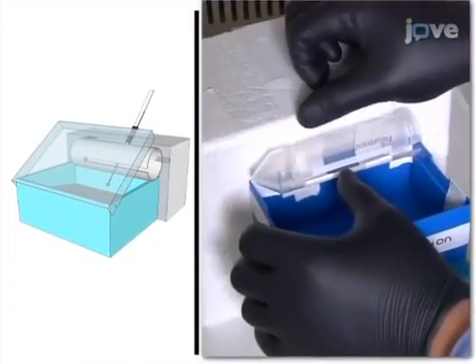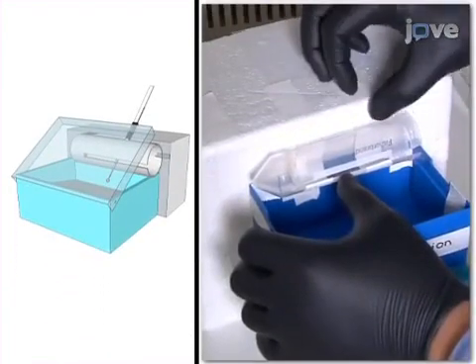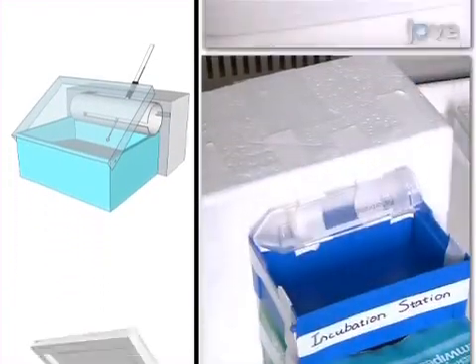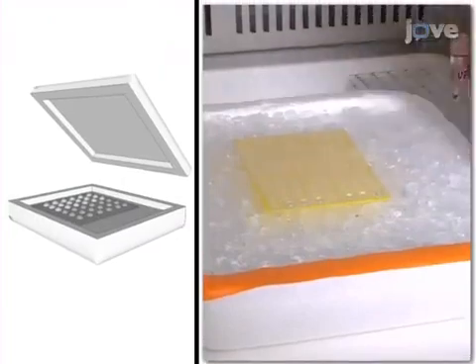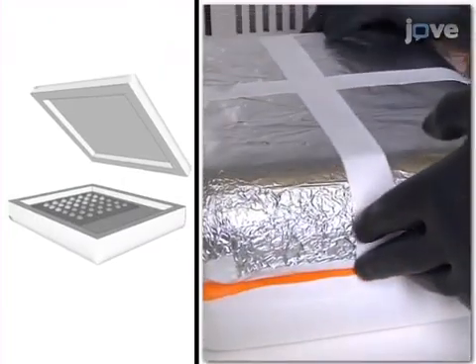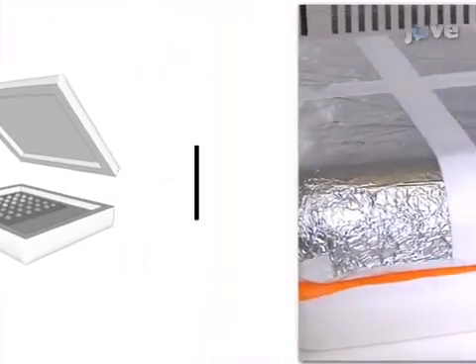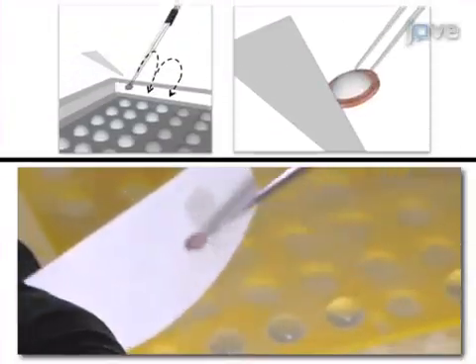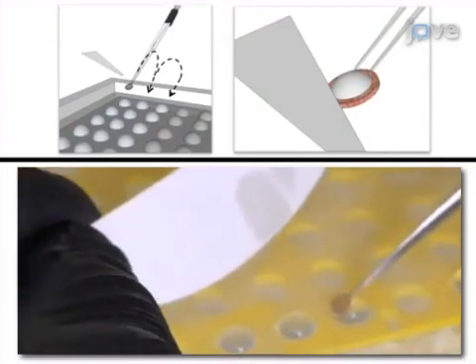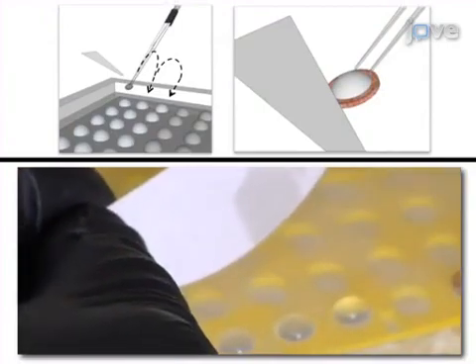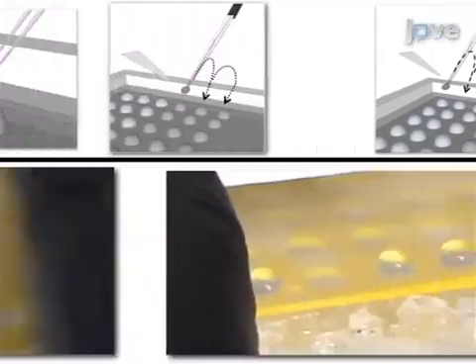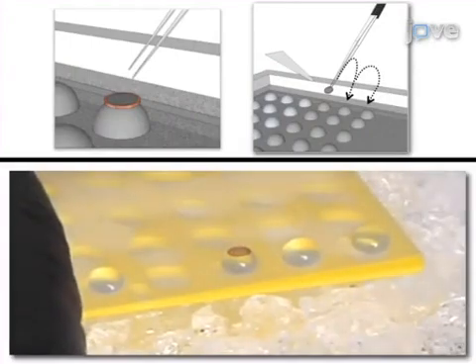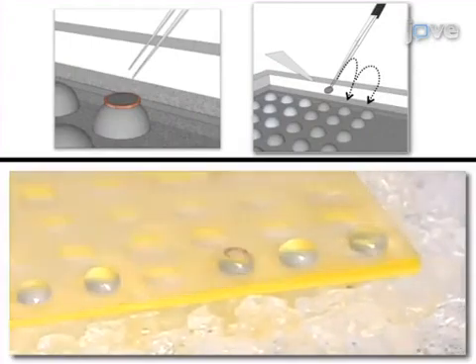This is accomplished by first incubating the protein in a prepared incubation station while preparing a negative staining workstation. The second step is to quickly wash the sample on three water droplets sequentially. The third step is to carefully stain the sample on three stain droplets sequentially.